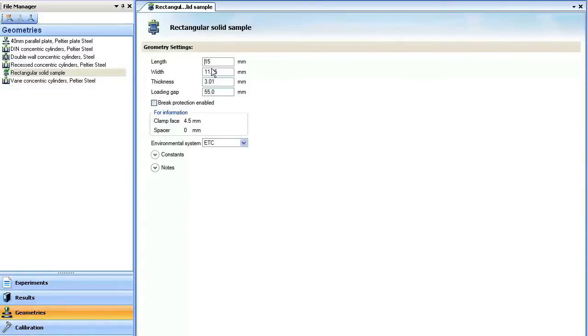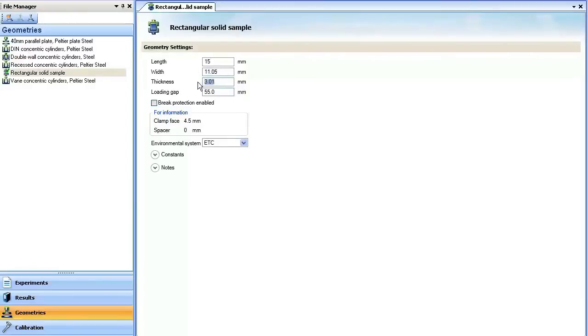There is no need to measure a length, as this will be measured by the instrument gap. So for my sample, I need to enter the width of 11.05 and the thickness of 3.01.